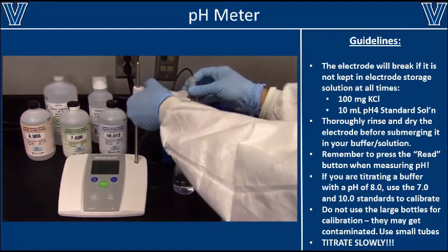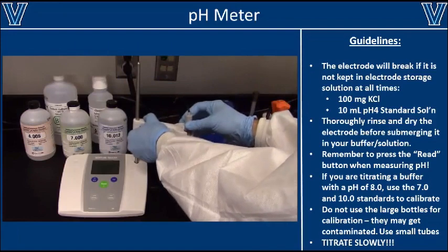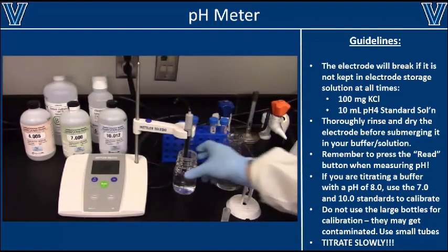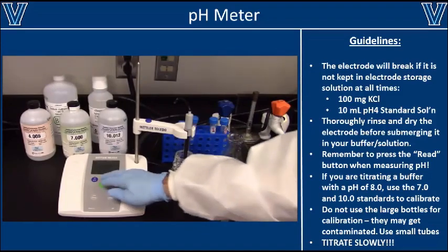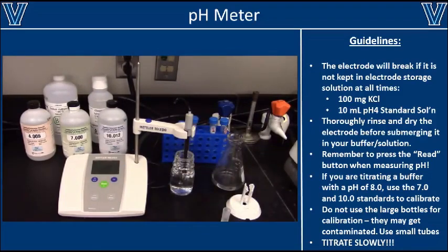To measure pH, completely submerge the tip of the electrode into your solution and ensure that it is vigorously mixed. The best way to do this is to use a stir bar and a stir plate, but you can do it with your hand if those are unavailable. Remember to press the read button on the pH meter and give it a little while to stabilize.